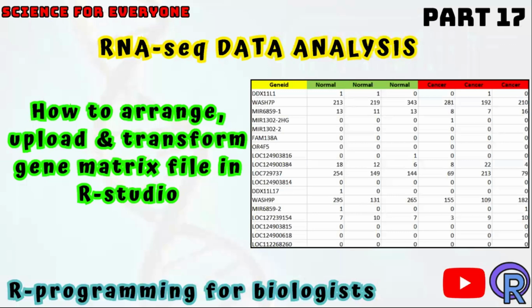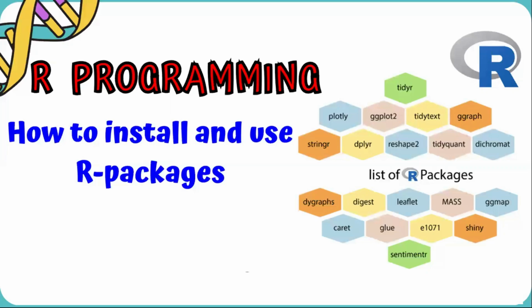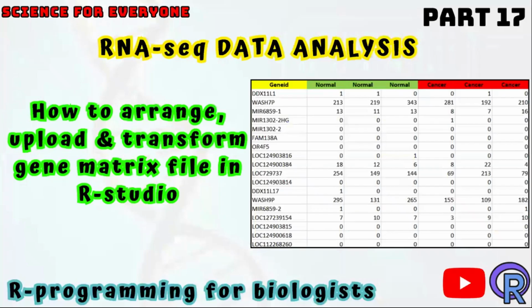Basically, as you all know, I have started a video series related to RNA sequencing data analysis, and this is part 17 of that video series. In the previous video, I discussed R programming, how to get started with R programming, the basics of R programming, and how to install the packages that are used for RNA sequencing data analysis. So I hope you have watched that video, because it is linked to today's video. I also showed you how to install and use R packages. And now when you are confident about the concept, today I will show you how to upload and how to analyze a gene matrix file.